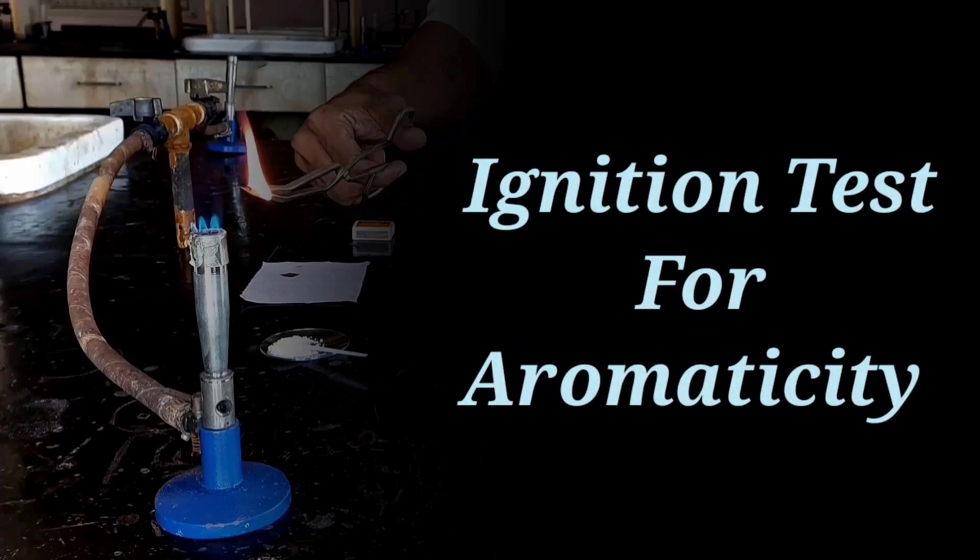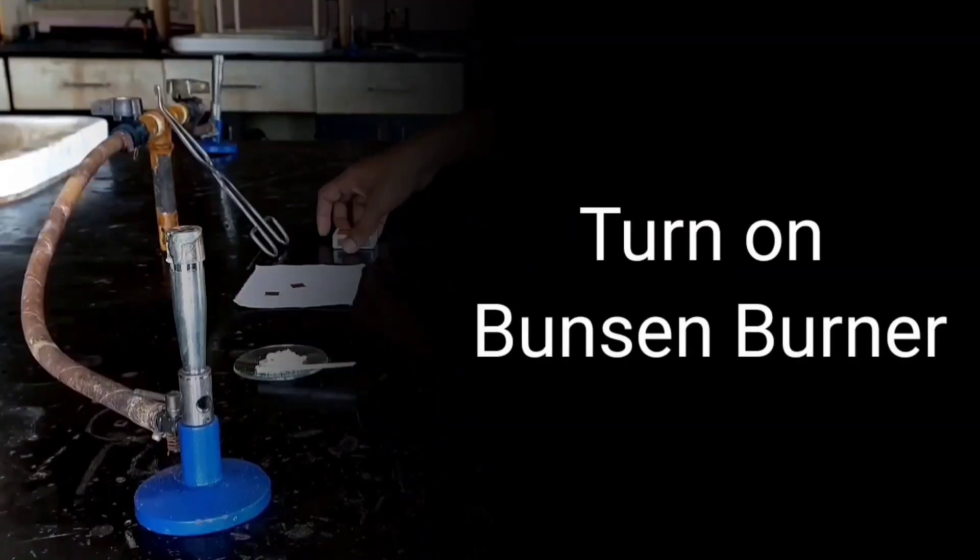Ignition test for aromaticity. Turn on Bunsen burner.